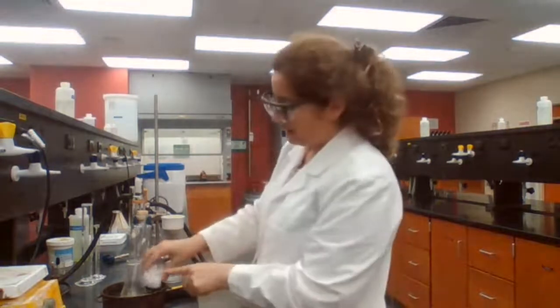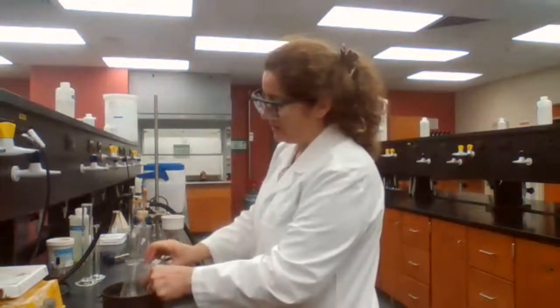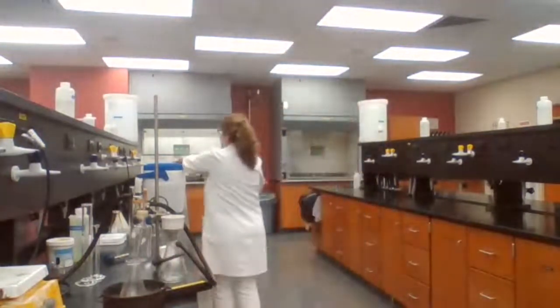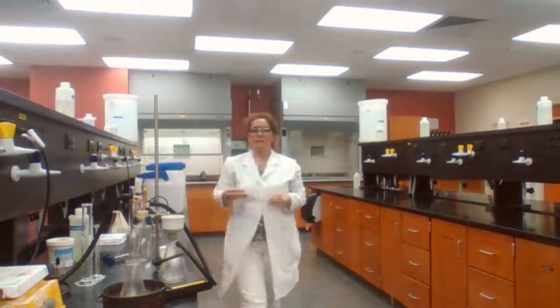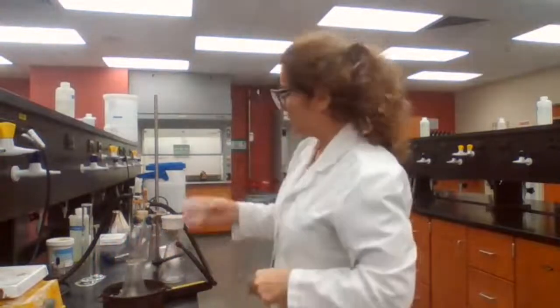Then it would be 5 minutes of vacuum. I run the vacuum for 5 minutes to make sure the solvent is removed completely. And 5 minutes in the oven that is set for 100 degrees Celsius.